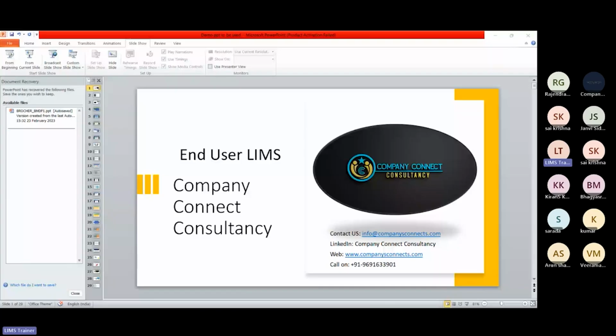So let's consider the different contents that are available in the LIMS, and see the flow of how laboratory information management works. Laboratory information management is not only limited to the pharmaceutical industry or biotechnology. Starting from clinical trials, wherever a sample is generated, laboratory information management is required.